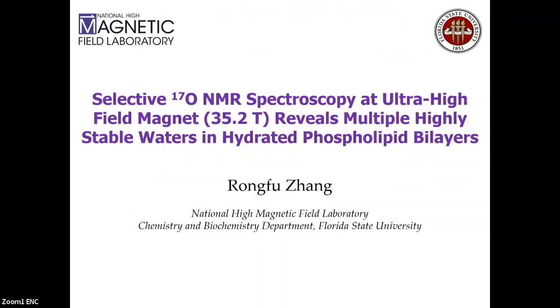Hi. Thank you. So I'm going to talk about waters, specifically membrane-bound water, and I'm going to talk about the new O17 NMR method. With this method, it would enable us to identify different types of membrane-bound waters on the cell membrane, or lipid bilayers.